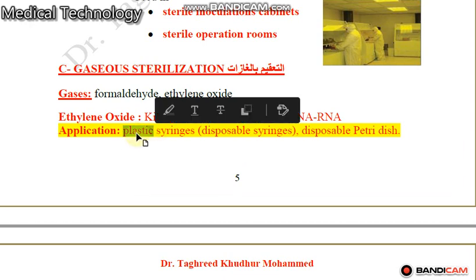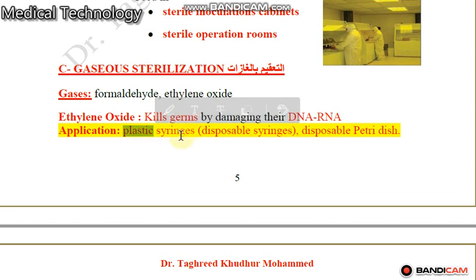Look, this plastic syringe or disposable syringe, disposable petri dishes, disposable pipettes, disposable anything made from plastic.